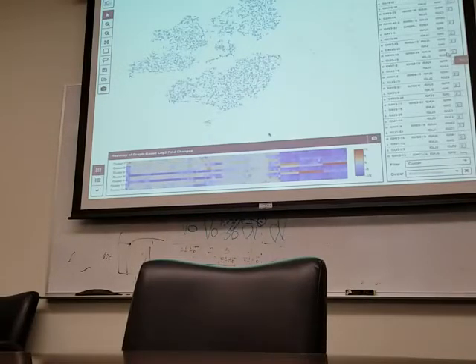So then looking at this data, if taking these sequences and then relaxing the CDR3 doesn't really buy you much, we might maybe go from 6 to 10 sequences.